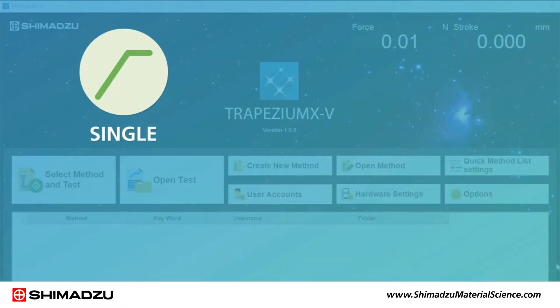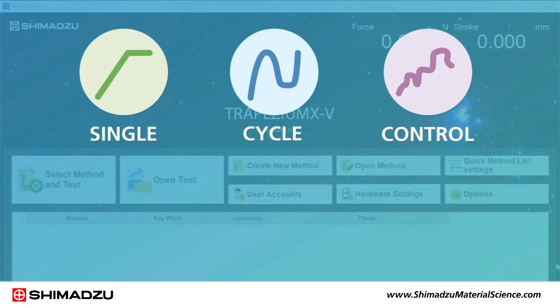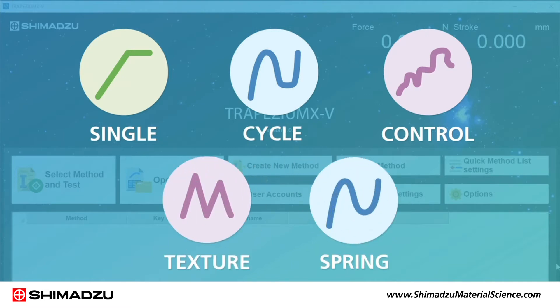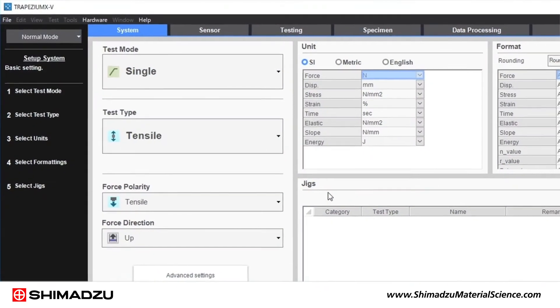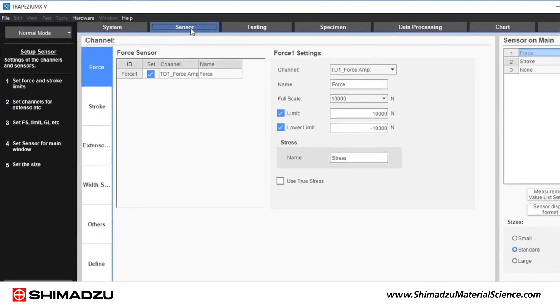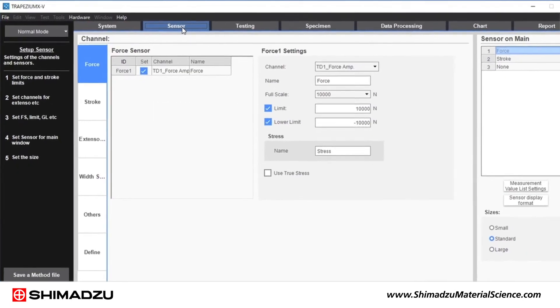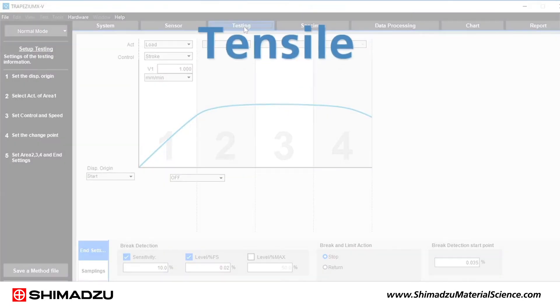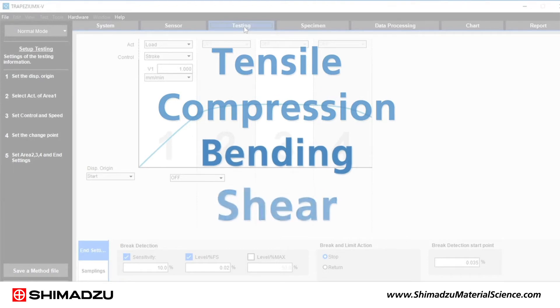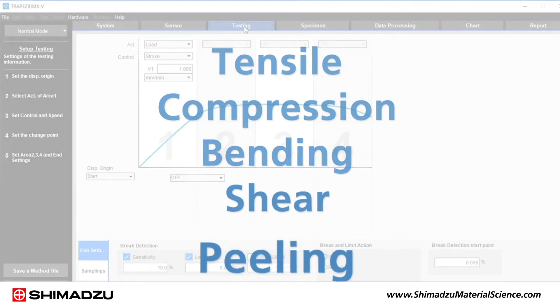The software features five modules so you can purchase only the components you need. The single module is our most popular and is perfect for unidirectional tests including tensile, compression, bending, shear and peeling.